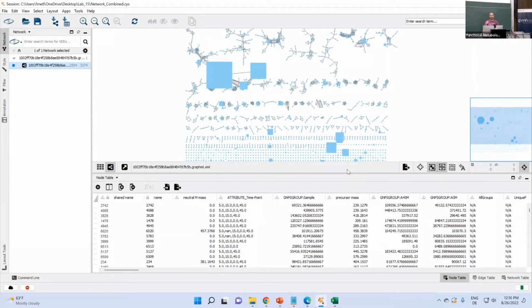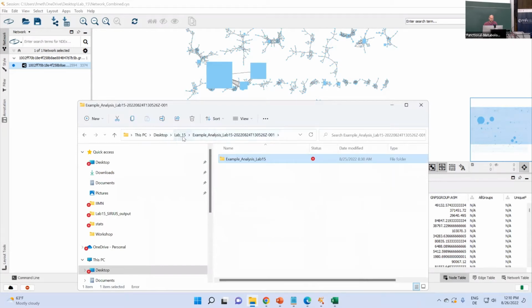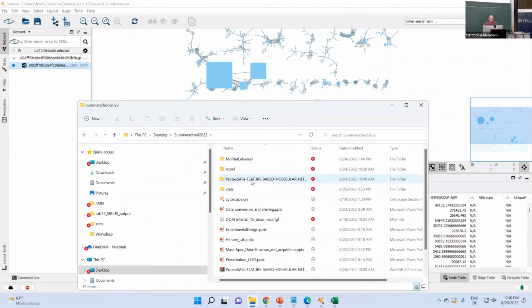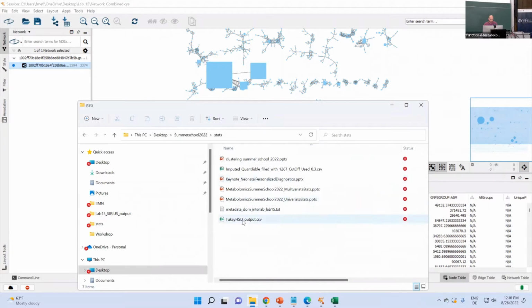Okay, and that way we imported this Canopus or Sirius information. We could also import any other information, for example the significance scores from your statistical analysis yesterday. Now this would not be an ID, but some sort of prioritization for the compounds that could be interesting. Okay, now I just need to find the folder here. I think it was somewhere in stats, nice. And here there was this output tables.